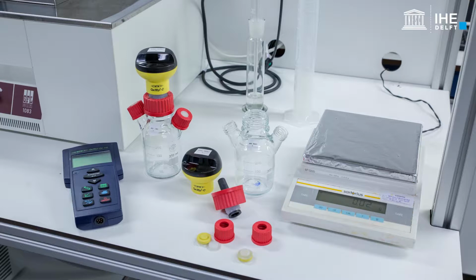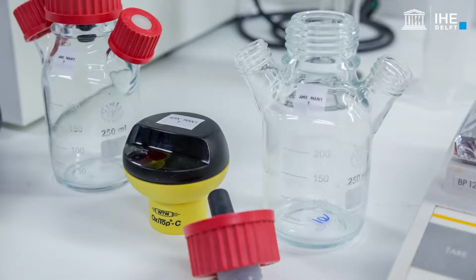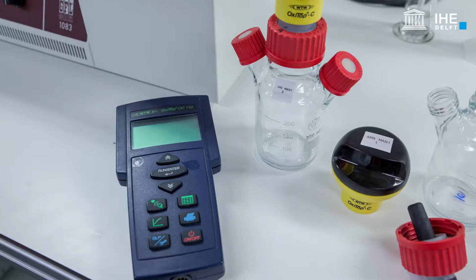In this test, the gas-tight batch reactor should have the following features: a working volume of around 0.25 to 1 litre, 2 lateral openings sealed by airtight pierceable septa used for substrate injections and gas flushing or discharge, and a manometric measuring device with a resolution of 1 to 3 millibars connected to the headspace, if possible equipped with a data logger. The one used in this experiment had a resolution of 1 millibar.